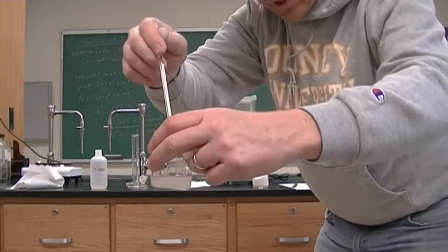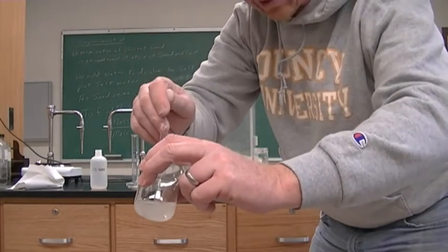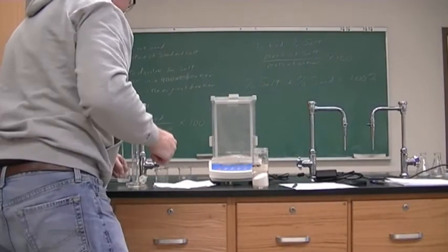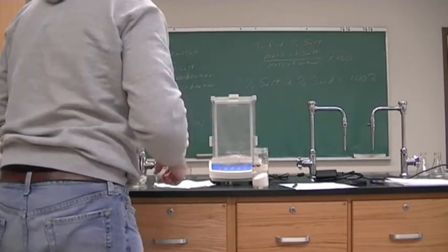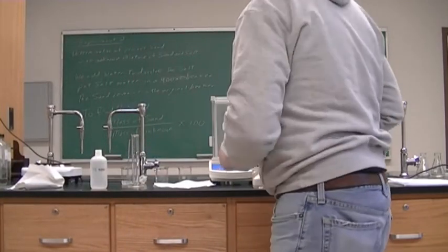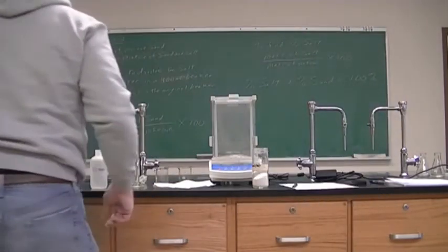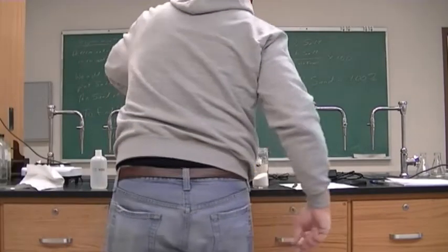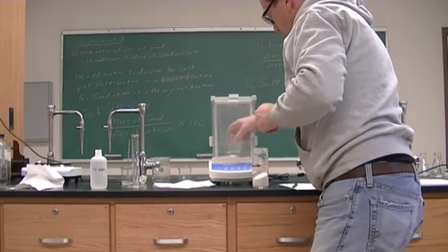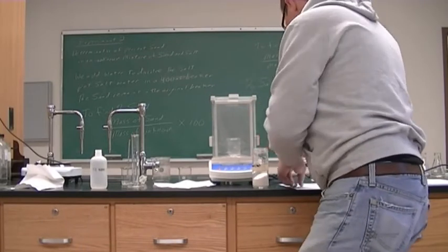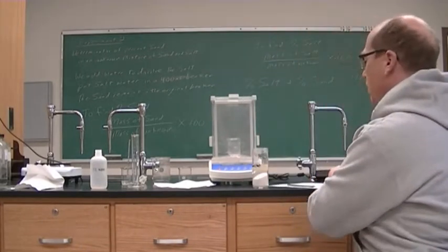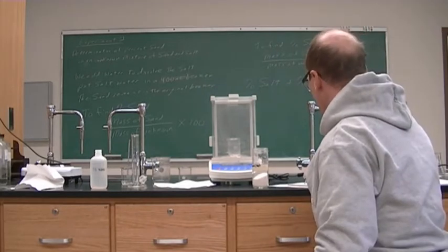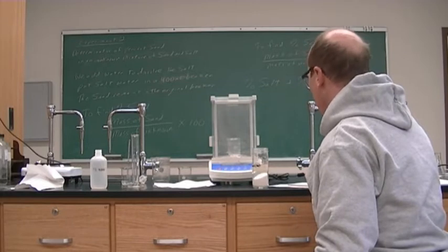We can see that it is not 100% salt because there is plenty of undissolved solid. While we let that settle for a minute, we are going to do beaker number 2. Beaker number 2 — the mass of the beaker is almost exactly the same: 46.3067.